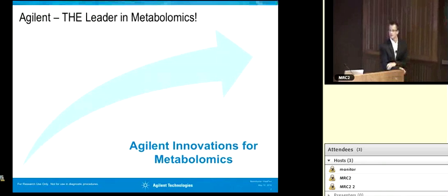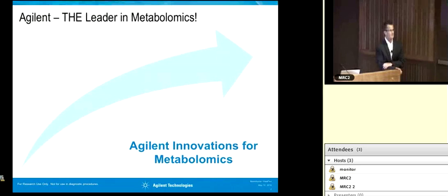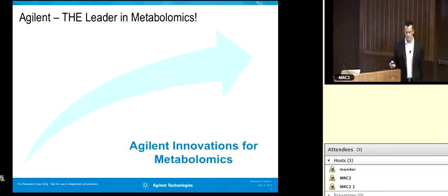And thank you again for the nice introduction, because it saves me some time talking about this slide. In the past, this has been a very manual process. You're going to start out by creating a target metabolite list. You're going to calculate all the possible M over Z's for those isotopologues. So you're going to say, I have fumarate at C12, and you're going to have to calculate what would happen if one of those was substituted with a C13, 2, 3, and 4. Then you're going to have to extract the chromatograms for all of those isotopologues for all of your metabolite targets.